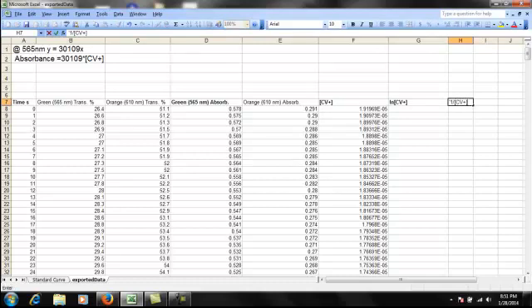Oh yeah, you might wonder why I put that apostrophe right there. That's to tell Excel that I'm not putting a formula into that cell. Okay, so there we go. I'm going to make that bold too because I like to label it. Now, to do those transformations of the data, I just have to tell it, in this cell, I'm going to say this is equal to natural log, ln of that cell right there, enter, and that has just found the natural log.